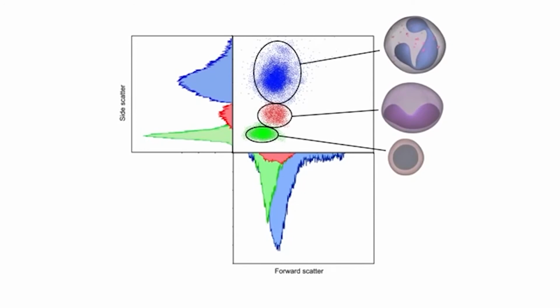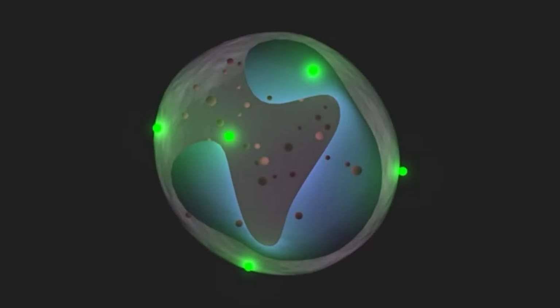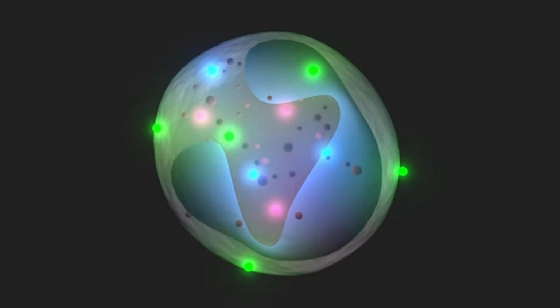Okay, besides analyzing the cell shape, size and complexity, the flow cytometer can also detect emitted light from the cells. Okay. From excited fluorescent molecules, you have fluorescent labels such as fluorescent dyes and stains.